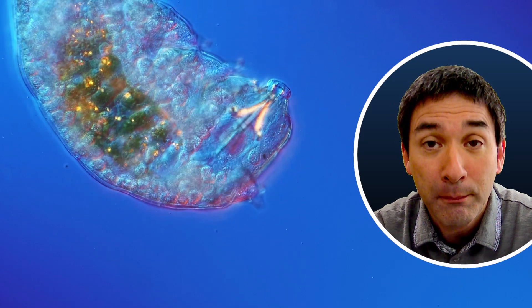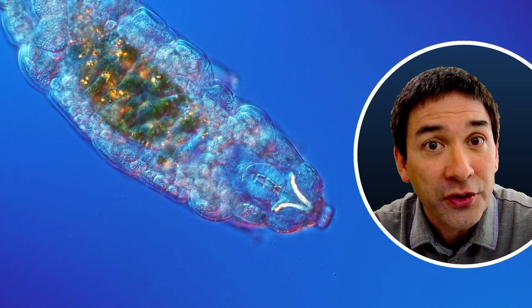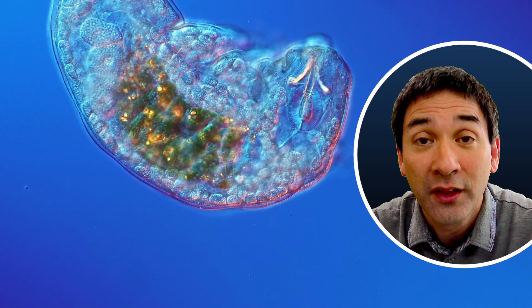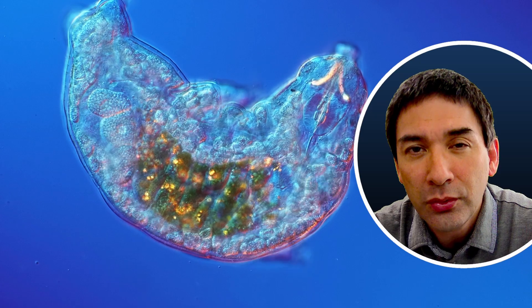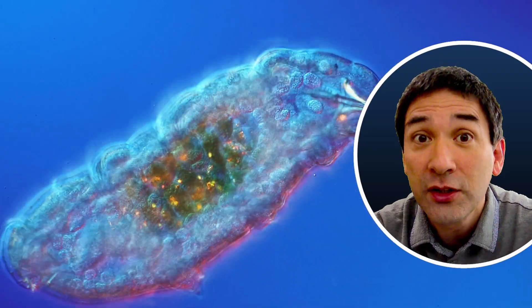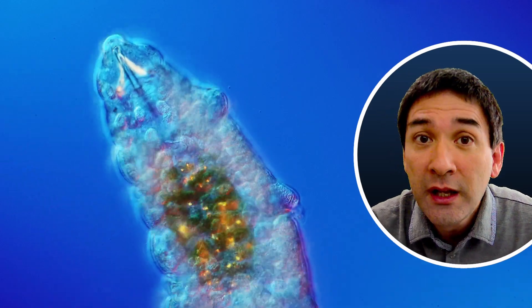However, some moss samples were not quite successful, and I found out why. Moss that is exposed to large changes of temperature and maybe even sunlight — like moss growing on exposed rocks — I was not very successful in finding tardigrades there. I also allowed that moss to take up some water, but still tardigrades were nowhere to be found. The moss in the forest at constant temperature that never really dried out completely was actually the type where I found more success. In other moss with a lot of change in temperature and moisture, I found many other microorganisms but not so many tardigrades.